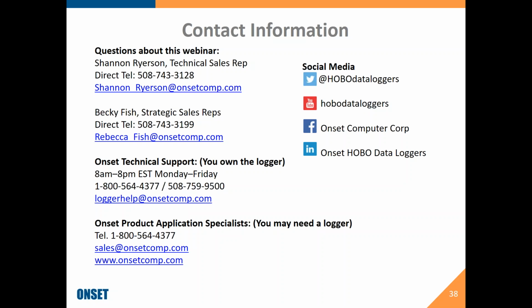Question about the pH electrode, and I guess there's a spec sheet on our website that says the electrode life is 6 months. That's not really a steadfast spec. That's an average spec based on our recommendation for best guideline in terms of maintenance and quality of the electrode. We certainly would hope that users are checking the loggers. We typically recommend every few weeks, if not every 7 to 10 days during the first couple of months of deployment, just so that you can get a good gauge for what degree of fouling, at what rate, is occurring.